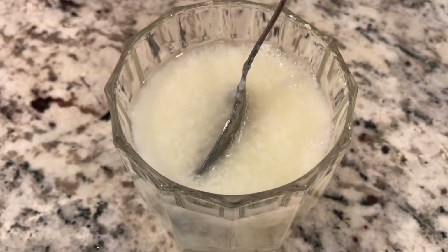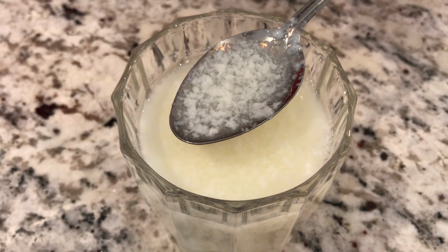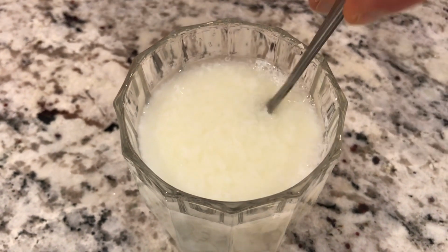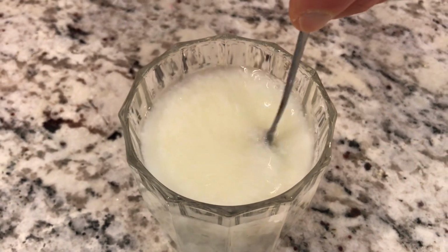So evidence of a chemical change? A new solid is seen. That's not something we're going to want to drink either because the taste is going to be changed too as well, right?